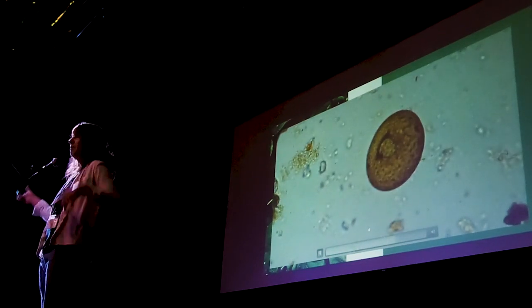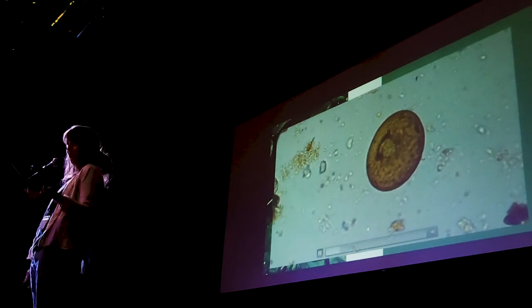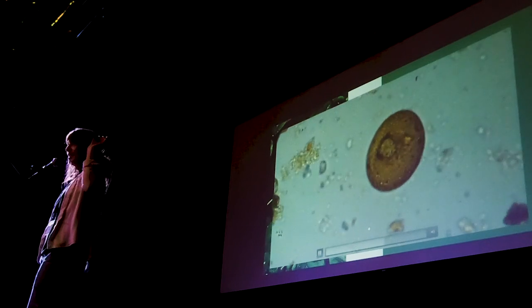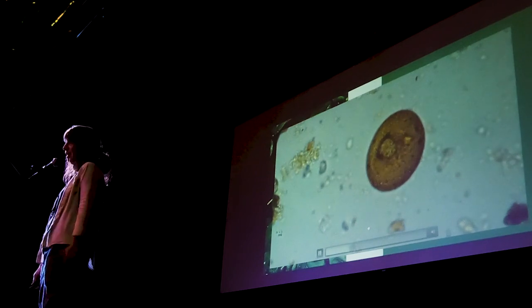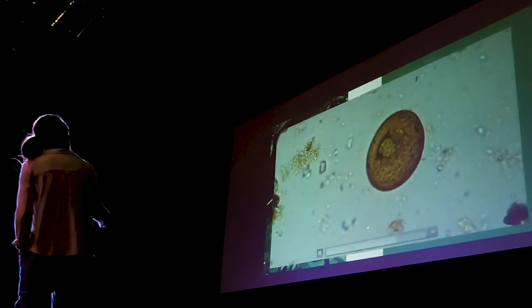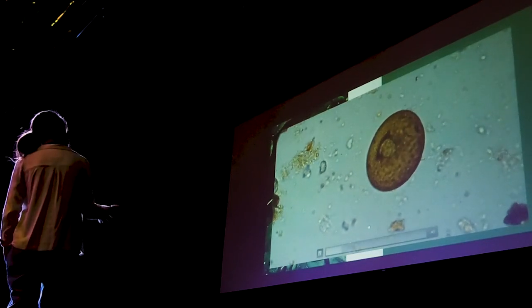So as that amoeba is living in the world, it's investing in its shell, it's adding to its house, it's upgrading. And the mineral that it uses is that color, right? So as it continues to add to its shell, it just gets darker and darker and darker. This one's pretty young. It's still got some yellow to it. Some of them turn almost red. They're super pretty. And they also remind me of just little vases or so. The structure's gorgeous.